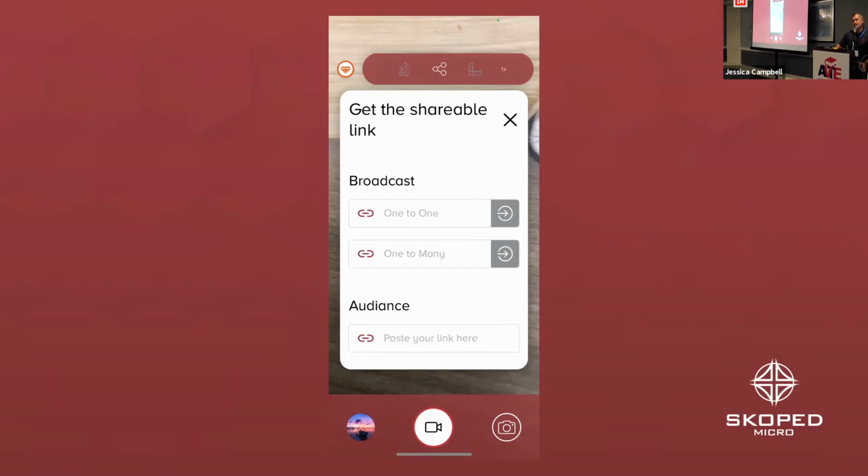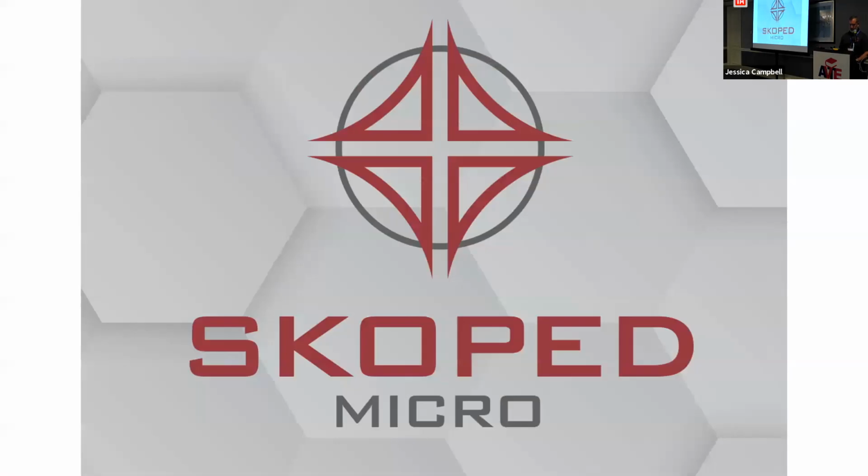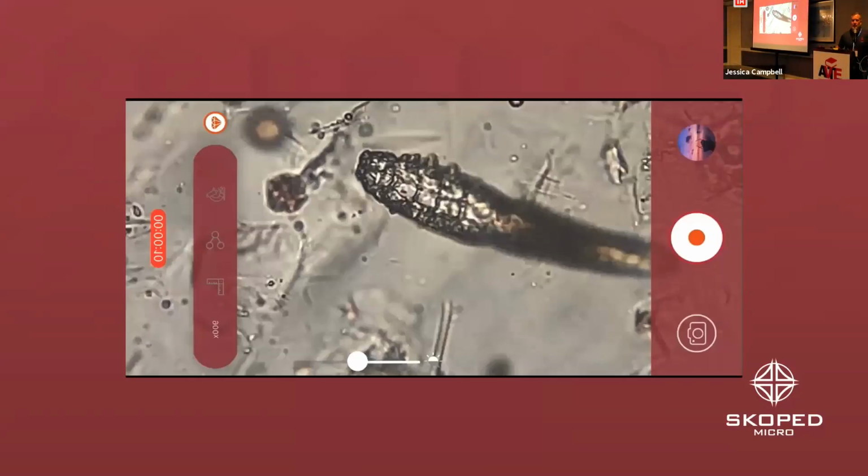Ideas? For sure. Speed of use, cost, overhead. Yeah, there's no doubt. But save time. If I don't have to have somebody package up 3 or 4 things to ship out, that's saving money. So the thing is, you've got to be good at making these slides, but you should be good anyway.